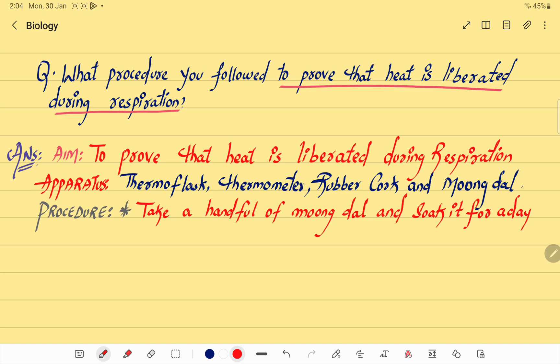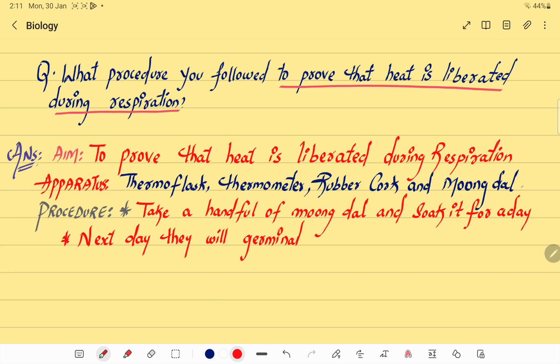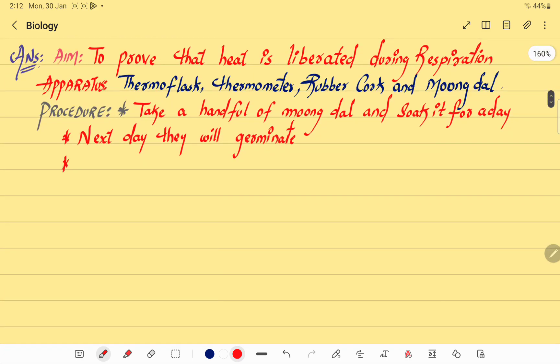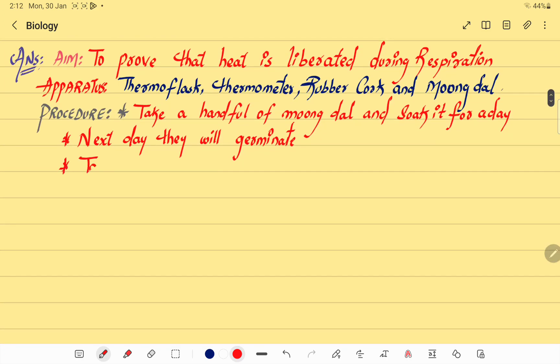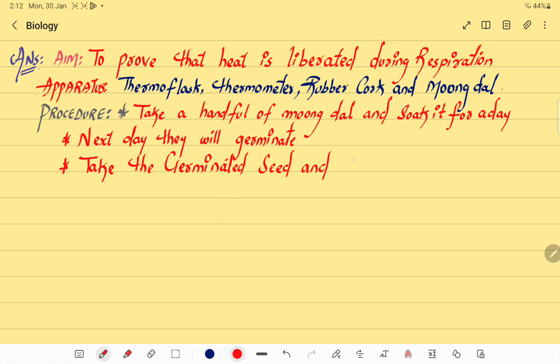The next day, the moong dal will germinate — that means the sprouts will come out from the seeds. Now take the germinated seeds.